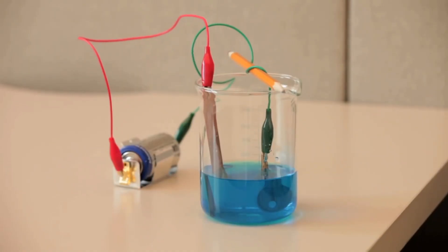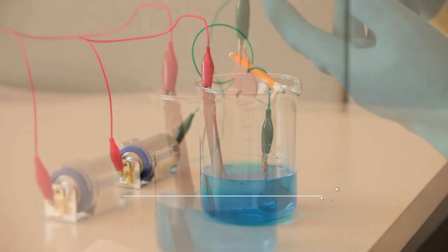Electrolysis is now happening. Copper ions in the solution are attracted to the key and deposit copper on it. Meanwhile, an oxidation reaction is happening at the copper strip to create more copper ions in the solution.